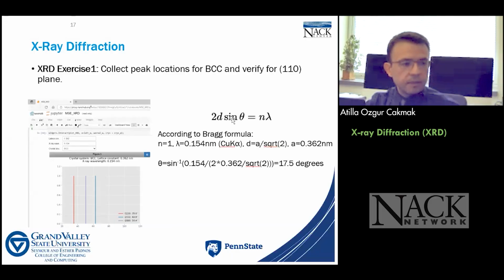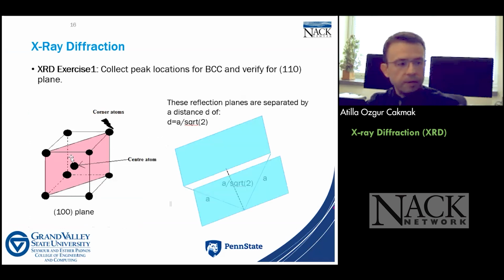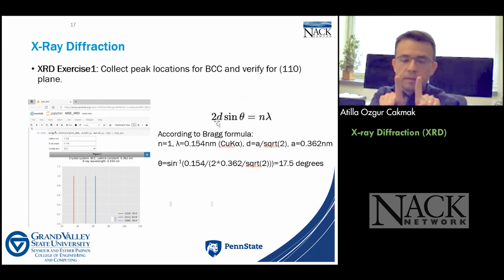And like I was saying, with a slightly higher level of class, we know this famous formula. Every one of us knows this famous formula when we're working in the field of XRD. This d is going to be the distance between these crystalline planes that we were looking into, I mean, these Miller planes. We'll have information about that. This theta and that d also had information about those two interference sources, the distance between those two sources. Do you remember that, the simulation that we did with the lasers?